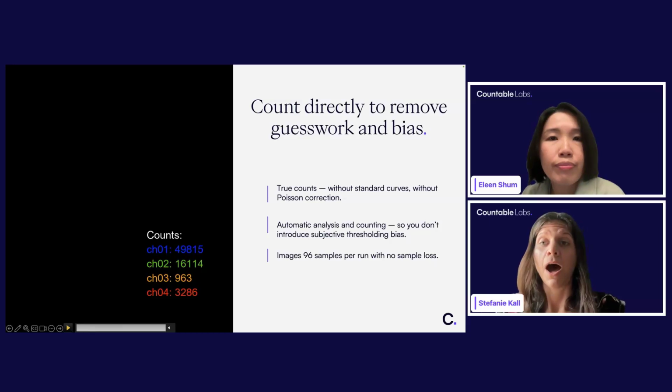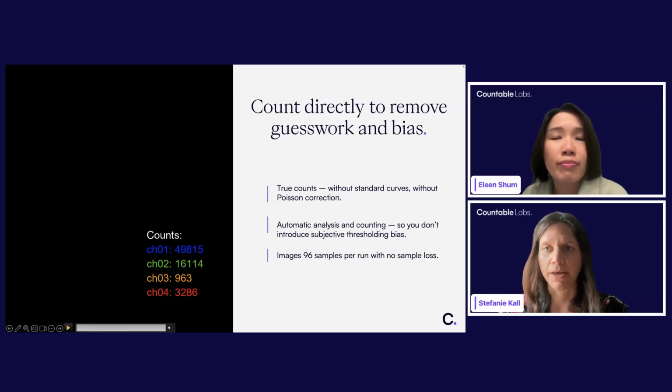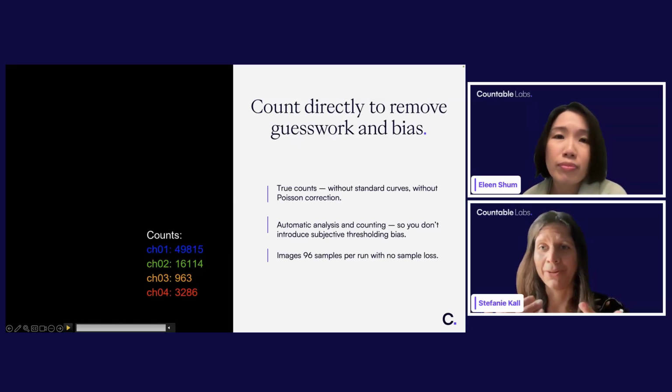We actually have a machine learning algorithm that can be incorporated into any assay. So if you are really concerned about something like that, it uses training samples to literally learn the difference between the background, a true signal and a non-true signal, for each experiment. So it gives even more confidence in picking out those separate signals.